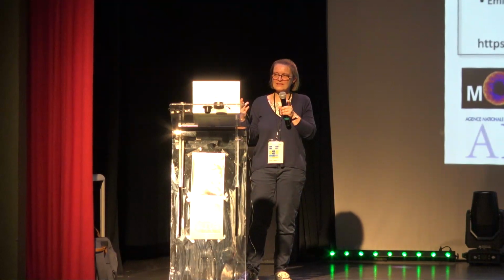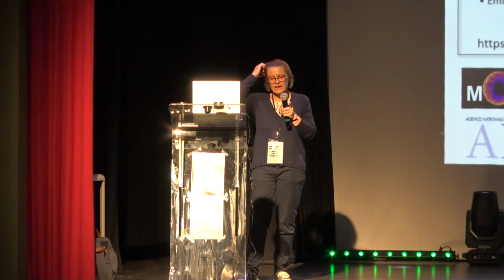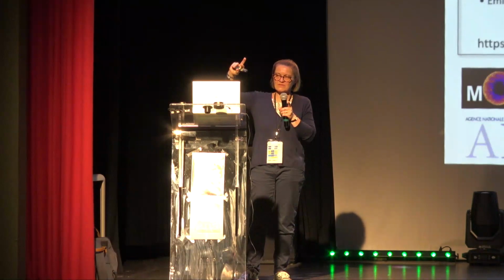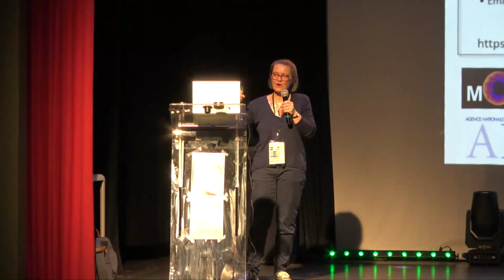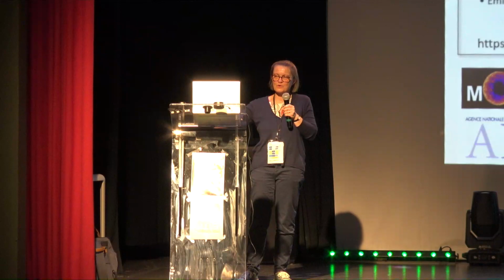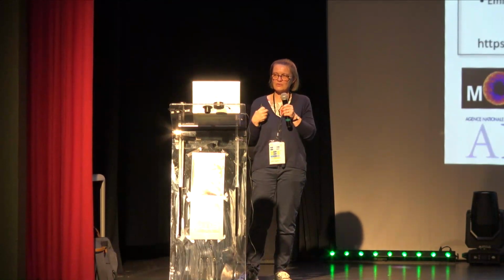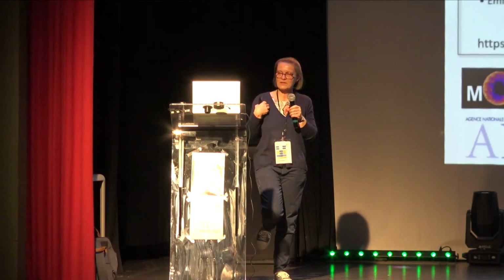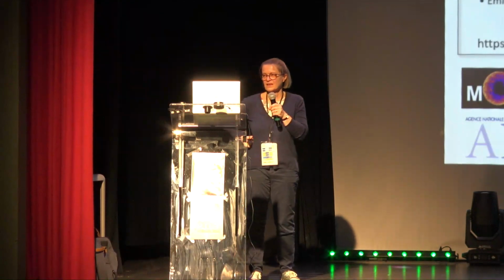And we also see that the anisotropy parameter, the ratio of the two main tensorial components, gives an idea of the alignment of the fibers within the focal volume. So it also can be used in this type of mechanical measures. That was done with my colleague Jean-Marc Allain at École Polytechnique.